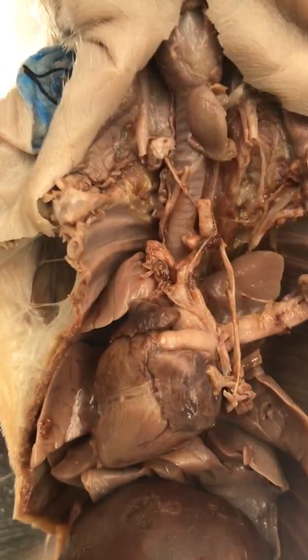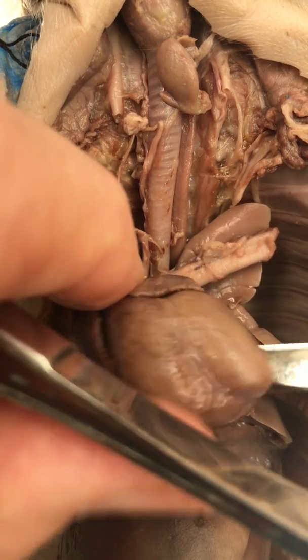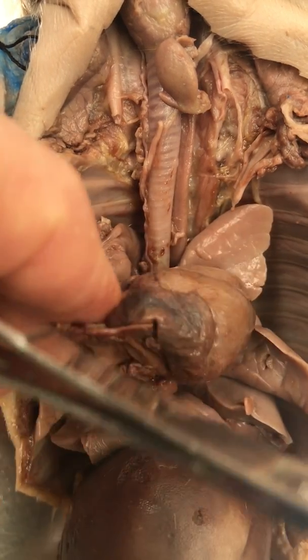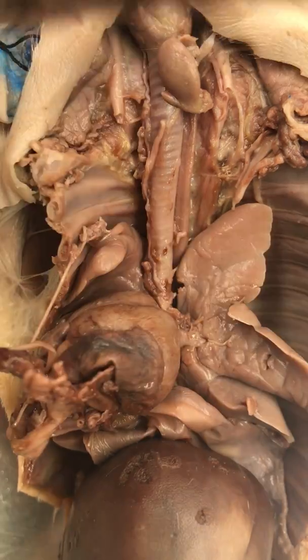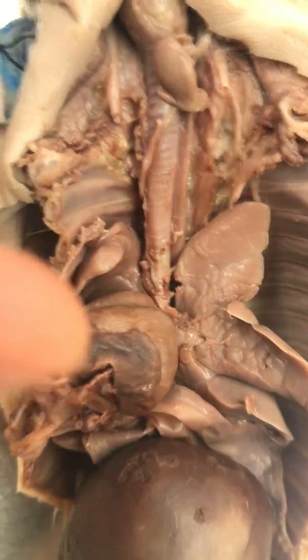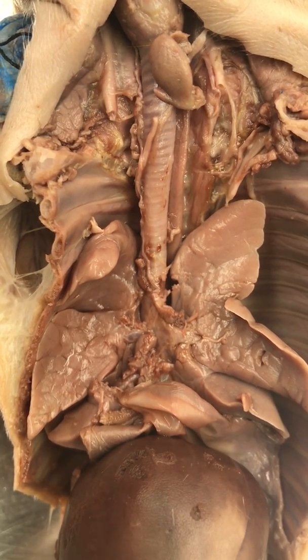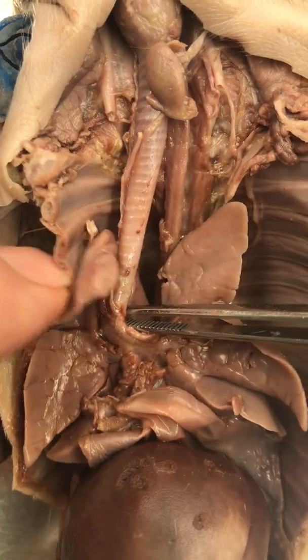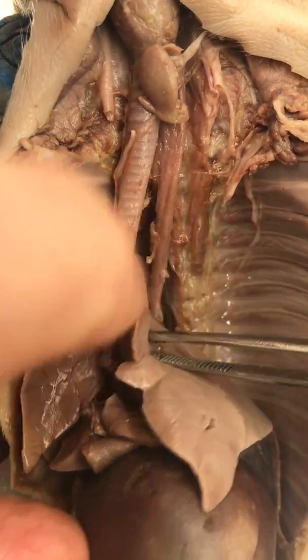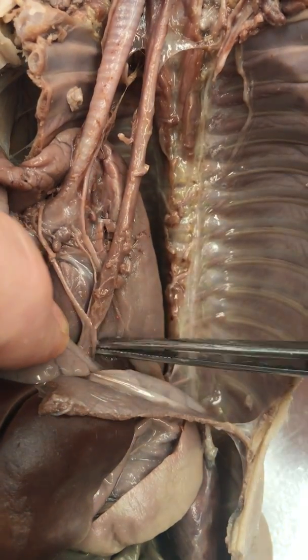All right, so I've cut some blood vessels, and this heart is now free at last. So we're gonna go through the parts here now that we can see it. Well, this is kind of interesting because now you can see the trachea going all the way into the lungs, and behind the trachea, here's the esophagus, and that's heading down to go through the diaphragm. You see that going through the diaphragm? Right, it's going to go through.